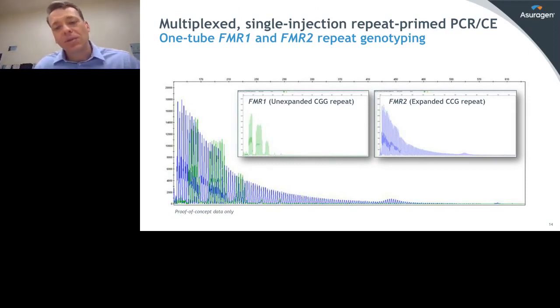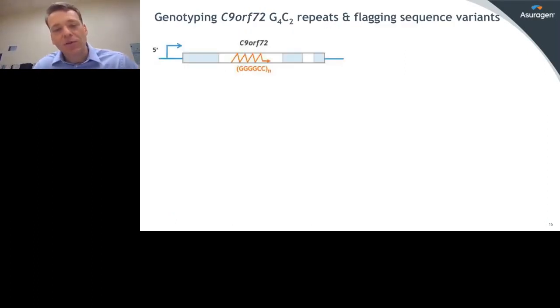We've tagged the primers that are specific to these 2 different gene loci with different dyes so that we can resolve them, just like I described with methylation PCR. And in this case, you can see the premutation expansion that's associated with FMR2. This sample that's in the tube here from the single tube multiplex is normal for FMR1, so you get the characteristic pattern. You can also see the AGG dips in that green trace. And so this shows that we can, in fact, multiplex different repeat expansion targets, even when they represent really difficult to amplify GC character, when we use the right instrument.